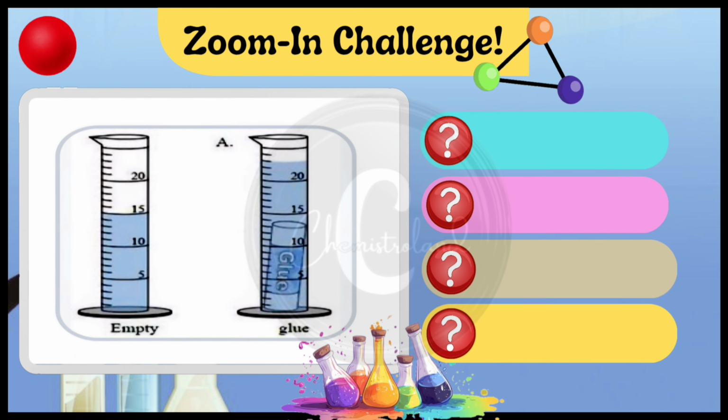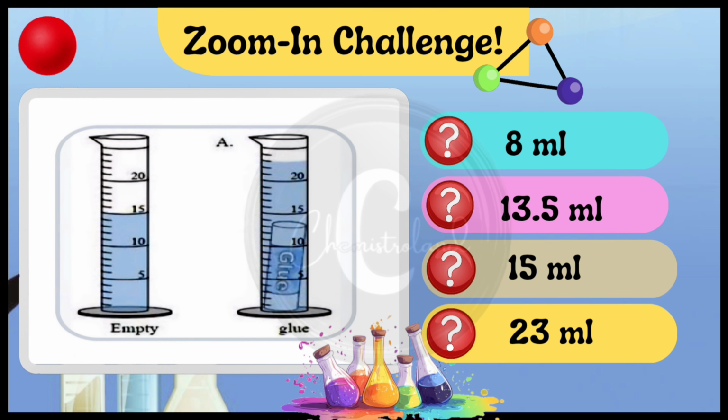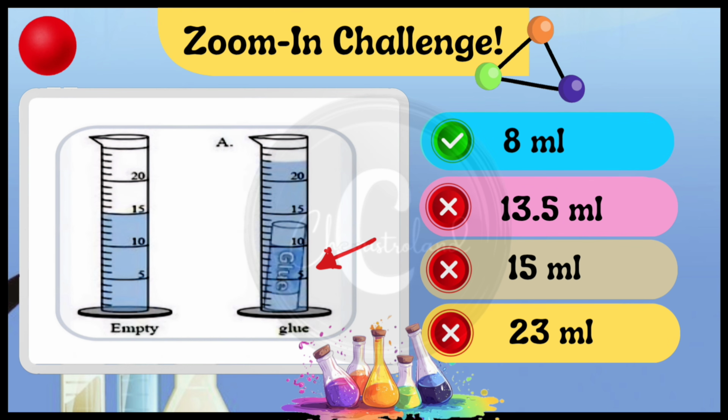Here is the zoom-in challenge. The graduated cylinder contains a glue stick. What is its volume? Eight milliliters is the right answer.